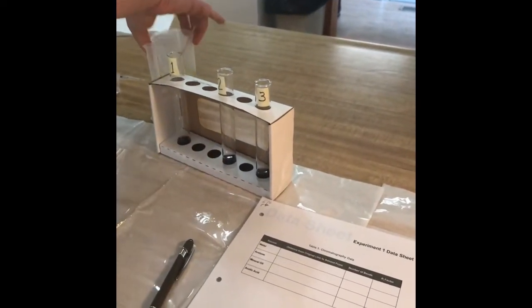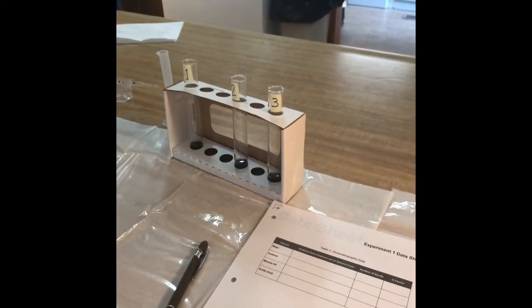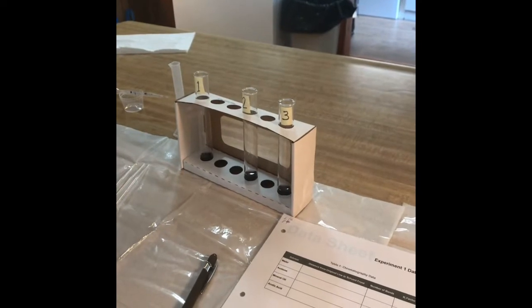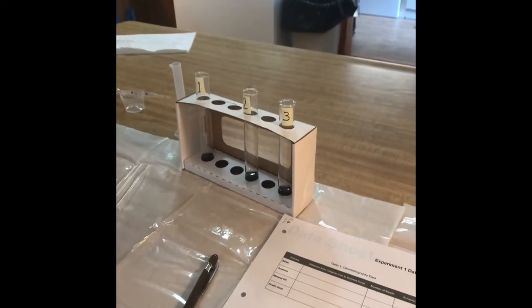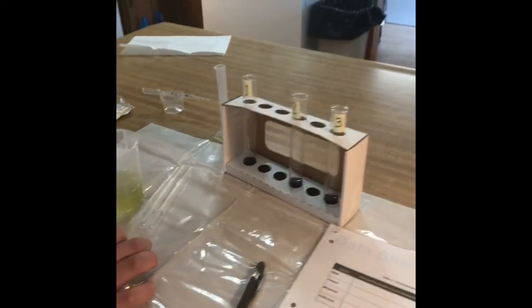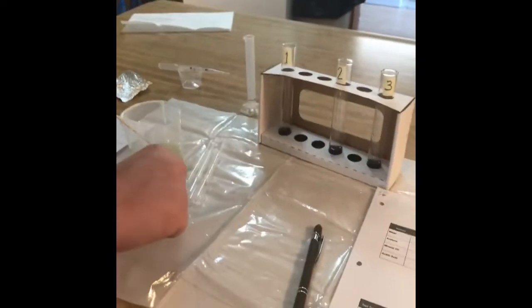Next, for step 4 of the experiment, I am stirring the chloroplast solution, which I prepared in part 2 of the experiment. I am now going to add 2 milliliters of this solution into test tubes 2 and 3.